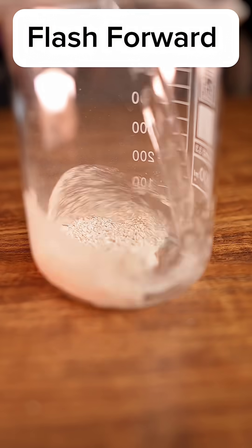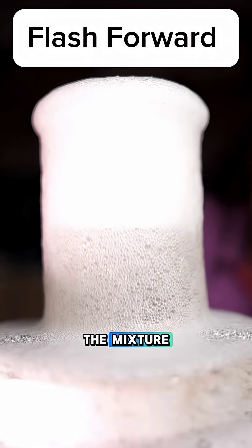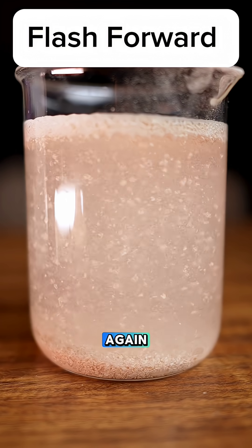Crush the eggshell, add vinegar, filter the mixture, add sodium carbonate, filter again — that's all.